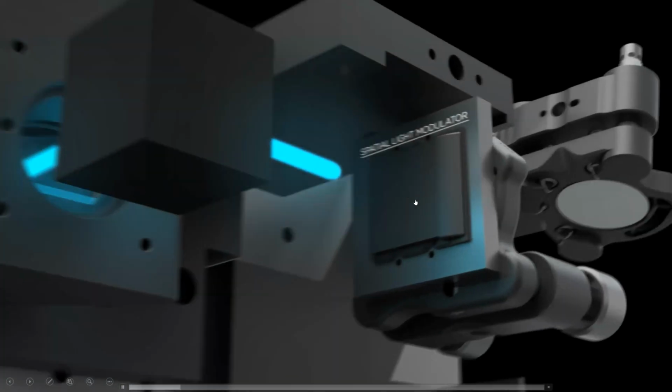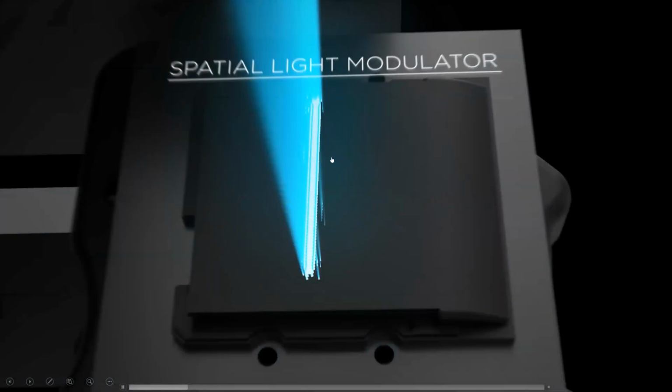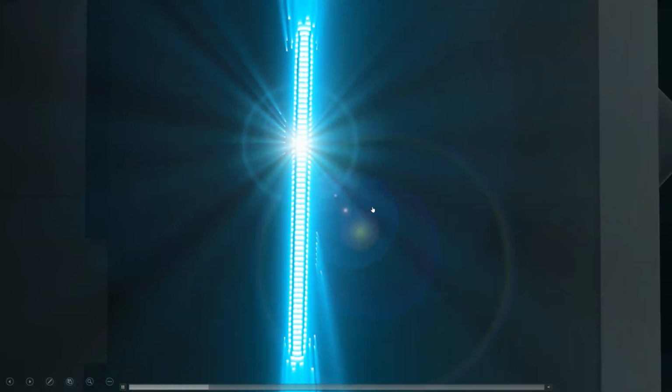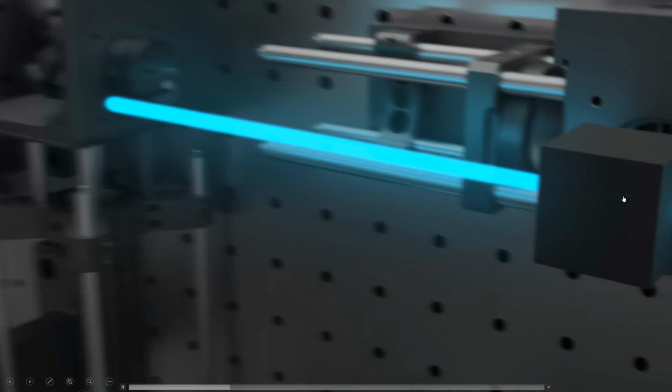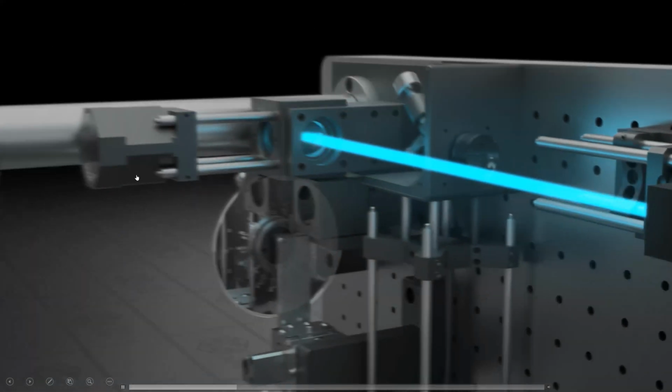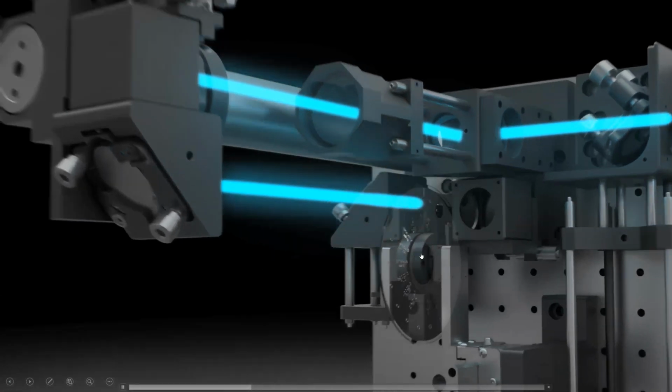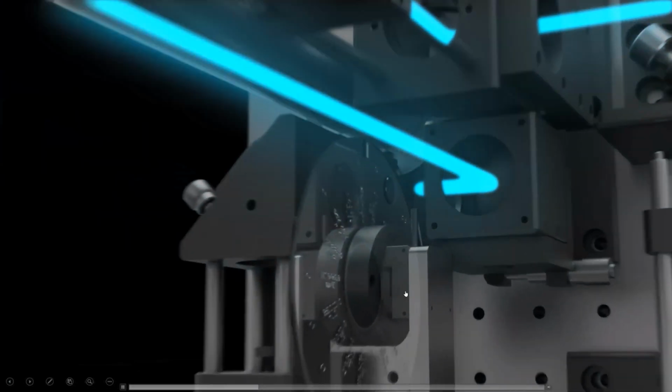And that static light sheet is used to illuminate the spatial light modulator. And this is where we actually do step one of lattice generation, where we impart this pattern onto the beam. The SLM acts like a little monitor, and it's only going to reflect back mostly the light that is projected in that pattern. That light then is relayed and focused onto the next important device, the annular mask. This is, thanks, April.